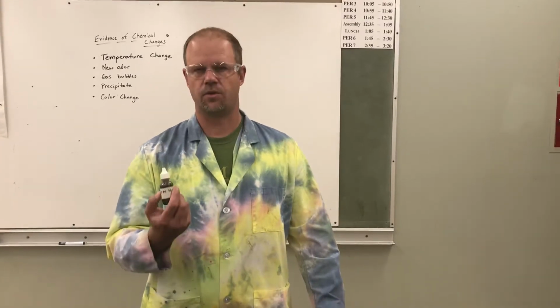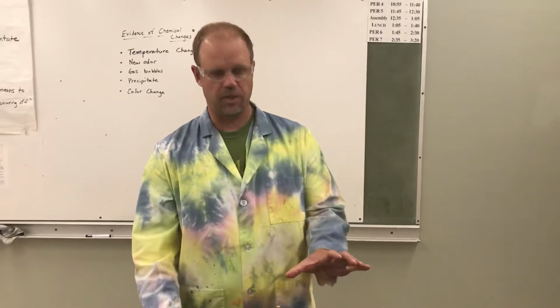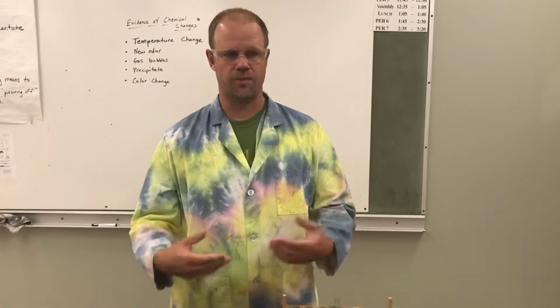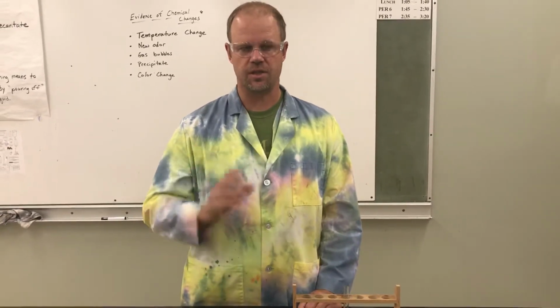Okay, this corresponds to experiment A in your lab. We're going to do the experiment here. I'll tell you what sort of observations I'm feeling and smelling, and you can see the changes. And I want you to write down the key things that you recognize.